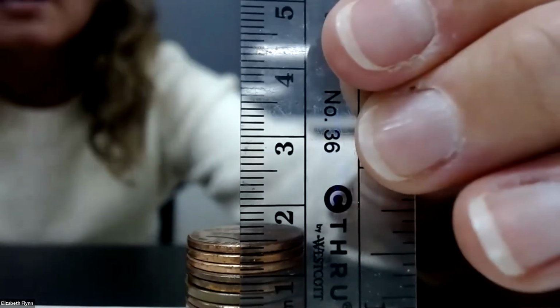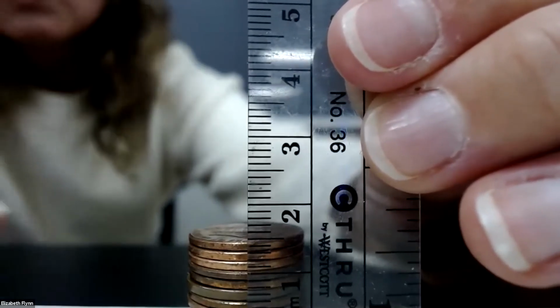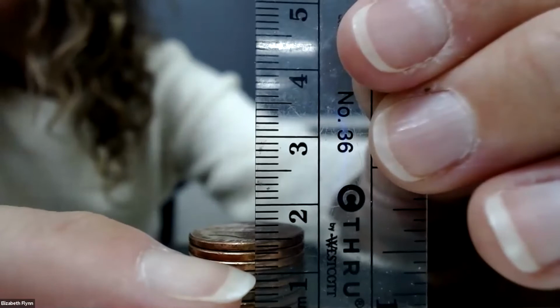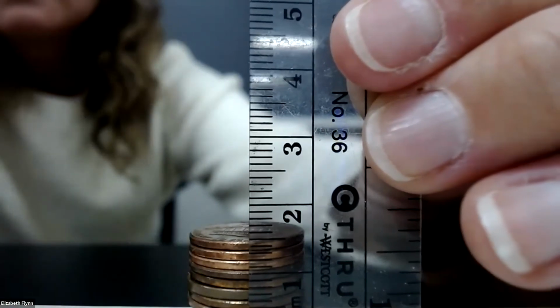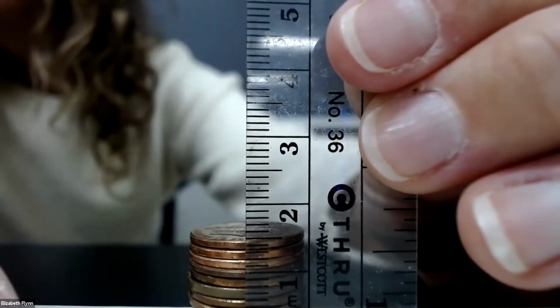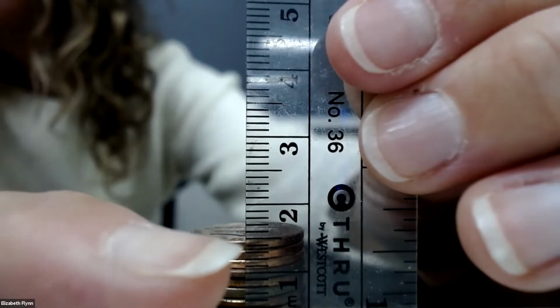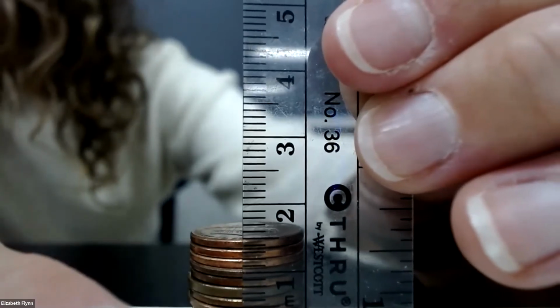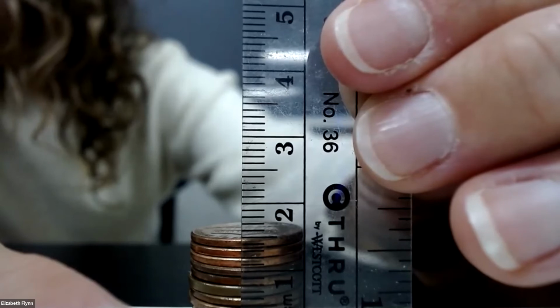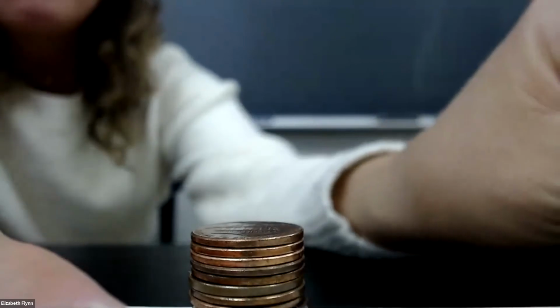And where it lines up to the ruler. We know it's at least 1. Here's our 1 mark down here, right? 1.1, 1.2, 1.3, 1.4. So what do we say? Where does the edge of that penny line up right here? 1.4, 1.42? What do y'all say about that? Right, 1.42 looks about right to me. Okay, so that's the height of my penny stack.